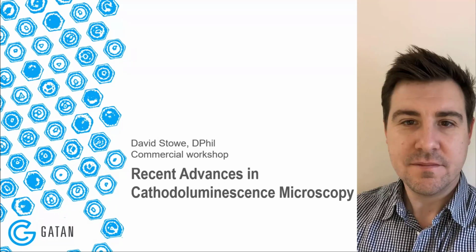I'm a product manager at Gatan for SEM products, and today I'm going to be talking about recent advances in cathodoluminescence microscopy. Now, I'm hoping that many of you who chose to join us are familiar with the technique of cathodoluminescence, or CL, as I'll refer to it in the majority of this presentation. But in case there are a few of you who are not familiar, then I'll give a quick introduction for a few slides before moving on to some of the developments that have been happening at Gatan and with our customers in the last 12 months or so.